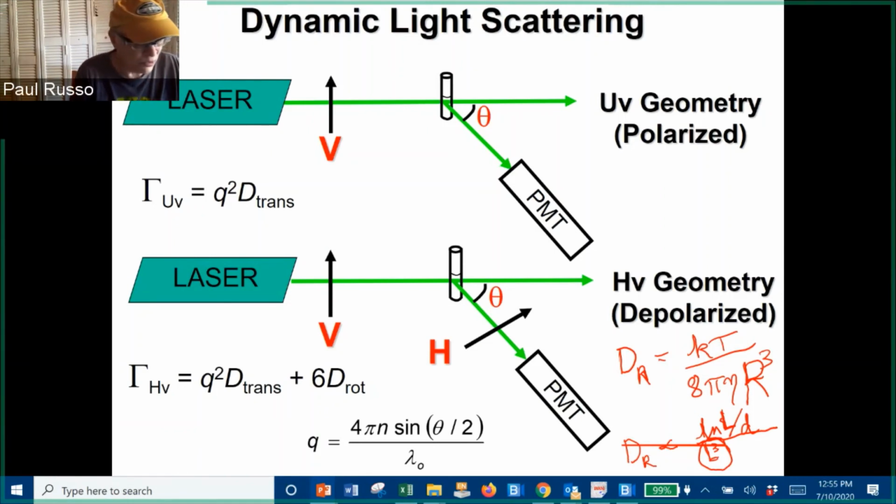So from the standpoint of an instrument that people can use in a biorefinery, this instrument is super simple. It's a cheap laser, some polarizers, a cheap detector, and a tube that contains the sample. You would just load in your cellulose nanocrystals and get a size distribution in a few minutes that would sample, I don't know, billions of CNCs. So if it works at all, it's going to be a nice little tool for biorefineries. And then maybe we can train it to do all the extra stuff that your image processing is going to do too.